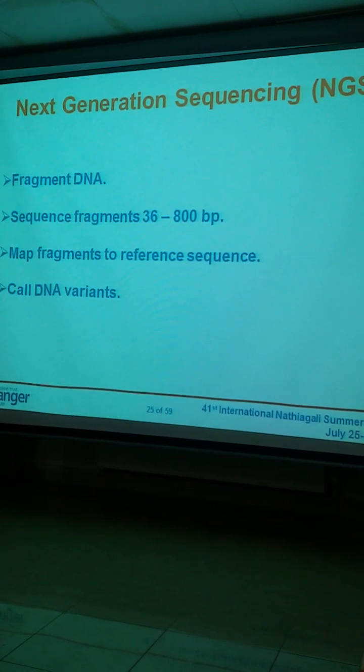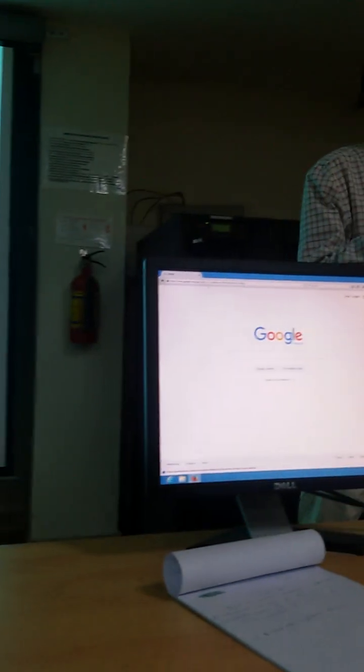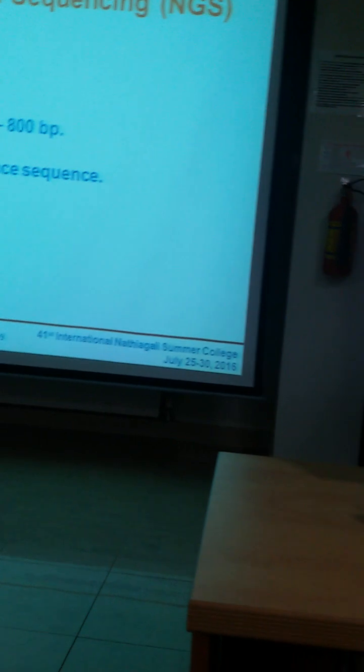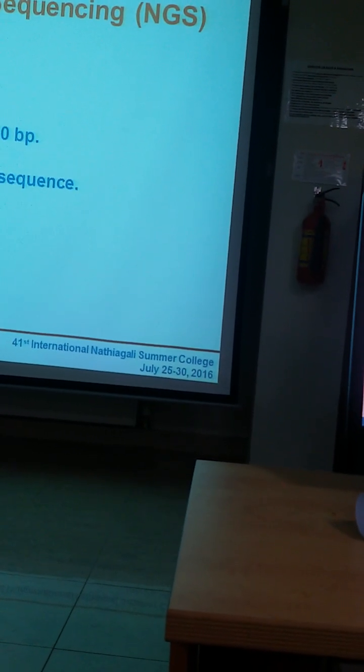They hand it over to the other group, which does the library QC, usually done on an IC. And once it passes the QC, we load it onto the instruments. Then the instruments just run, somebody just has to replenish the buffers. And if there's any problem, Illumina has an engineer on site. Reconstructing the fragments? That's a core bioinformatics group.